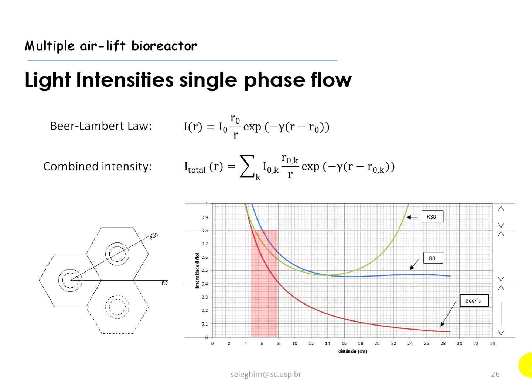And you see that if we consider the single illumination pole case, and if you consider that above 90 or 80% of the light intensity, you have photoinhibition here. So the cells want to protect themselves, so they don't grow. And below 40%, you have not enough light for the cells to grow. So the useful region here for the single illumination region is indicated by this red rectangle here.